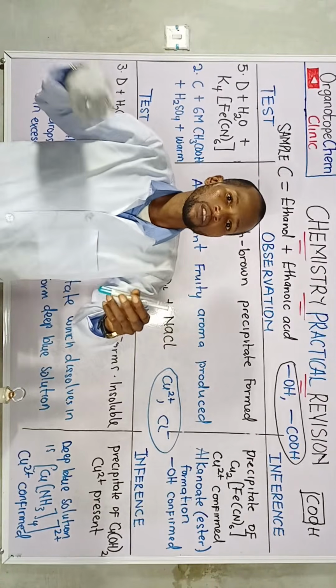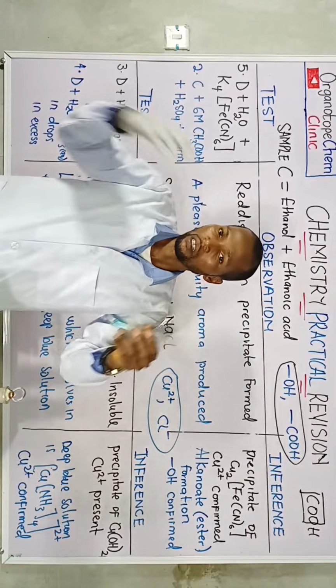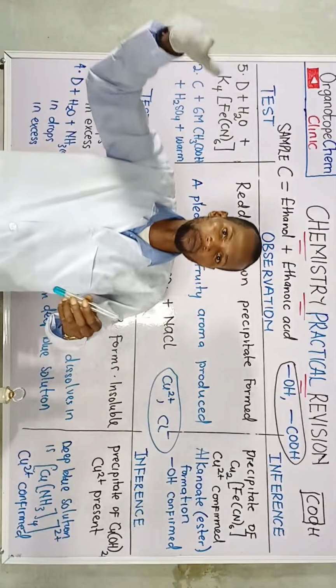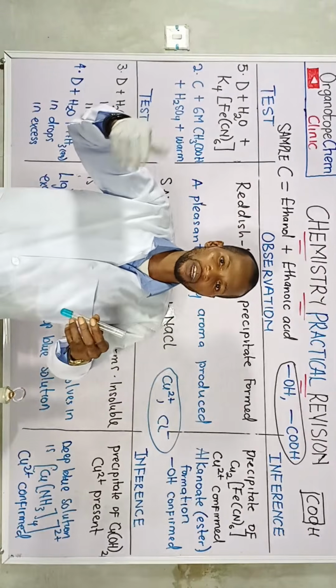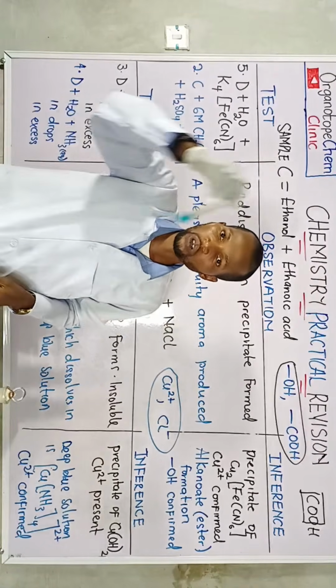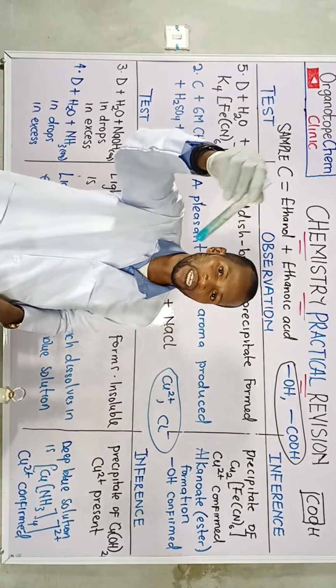But in the reagents provided, or the reagents that were actually stated from the exam body, HNO3 was not stated. So the HNO3 was not stated, and we are expected to have HNO3.